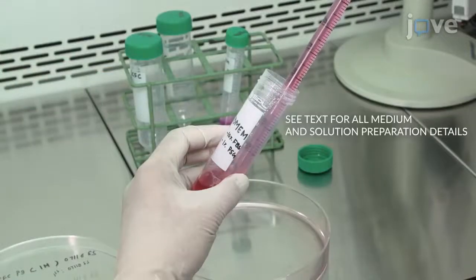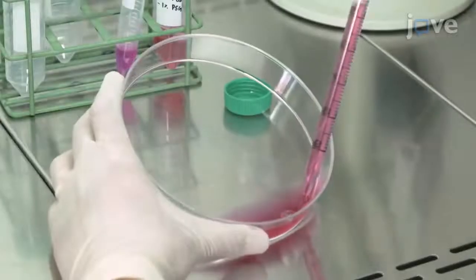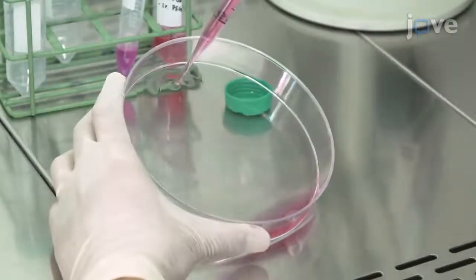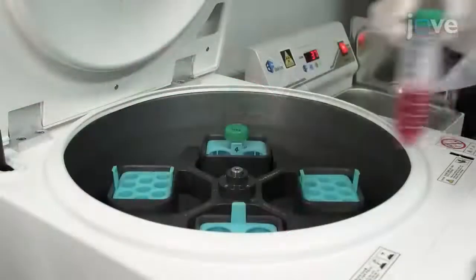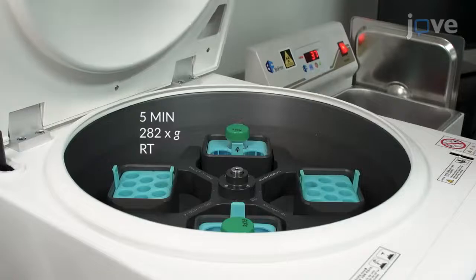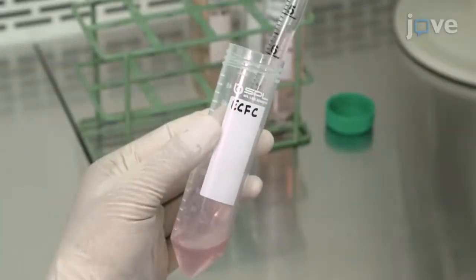Inactivate trypsin with fresh complete DMEM medium and pipette the cells a few times to generate a single cell suspension. Collect the cells by centrifugation, followed by two washes with serum-free medium.